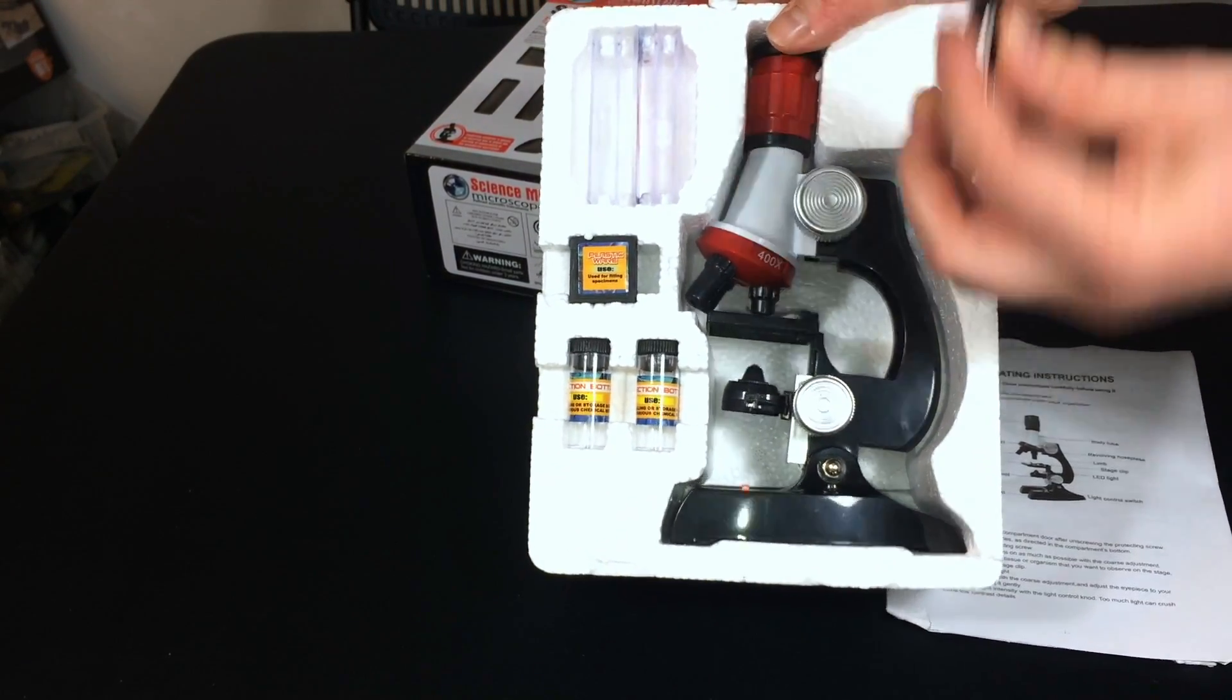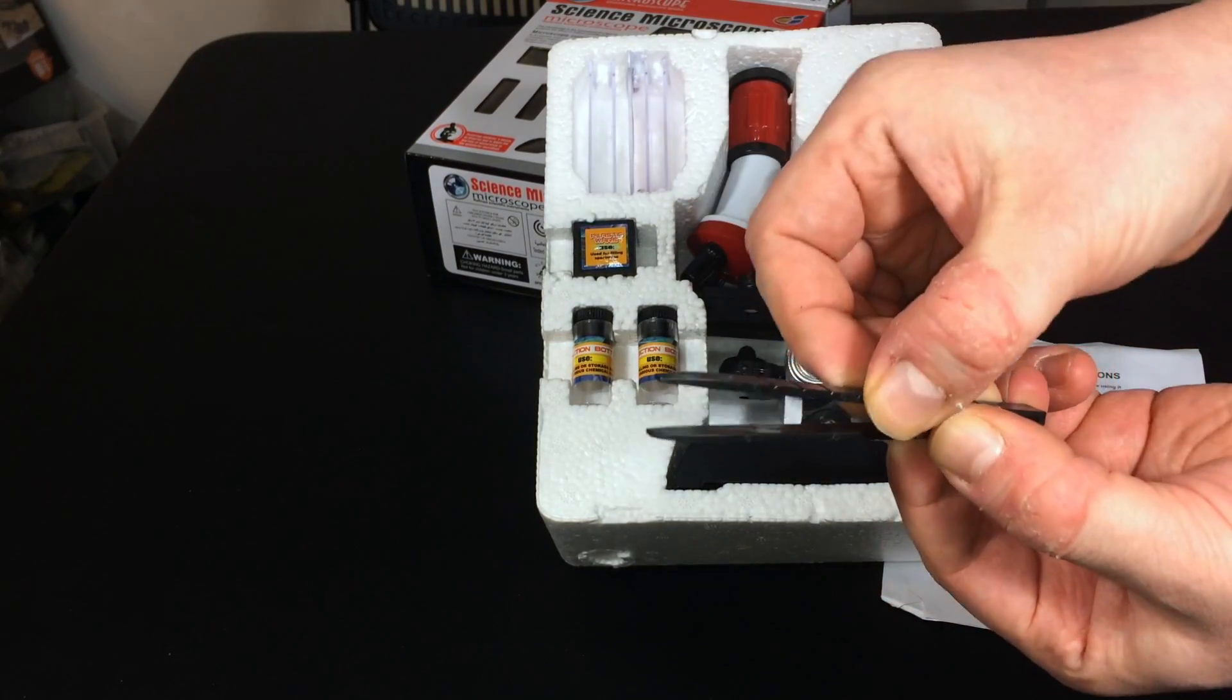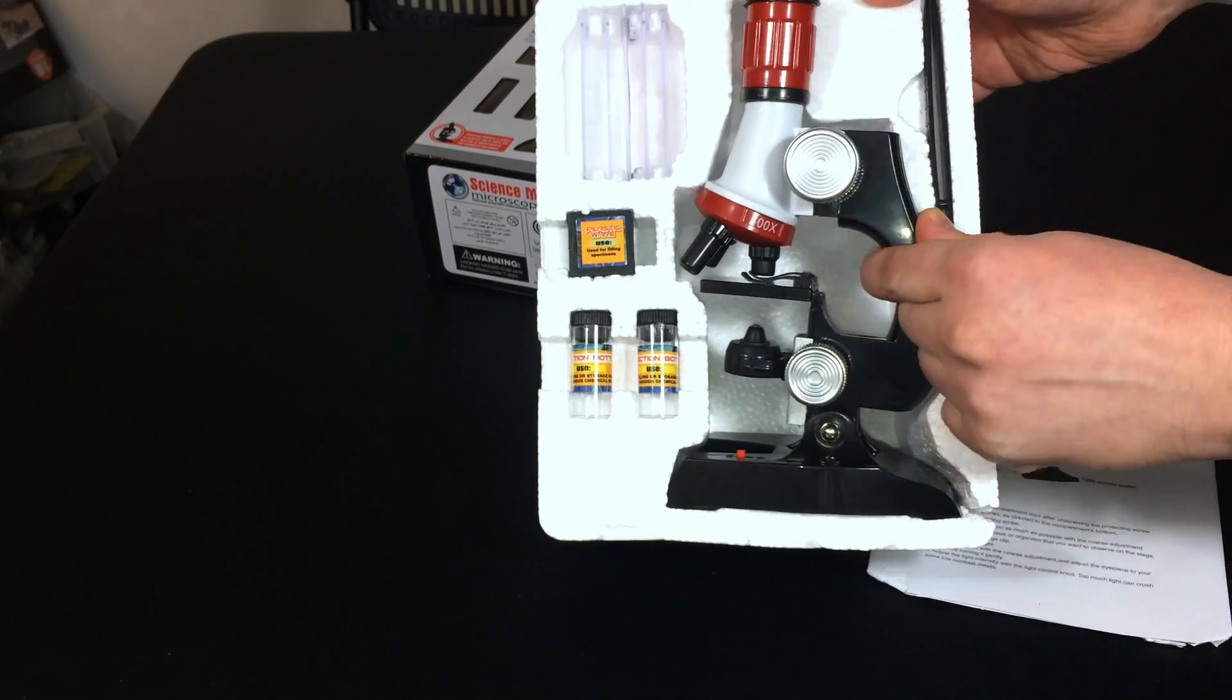Tweezers right here. Plastic. Very flimsy. Well, if you're a kid, nothing wrong with it. It's here at least for the money. Why not? All right, so let's take this thing out.